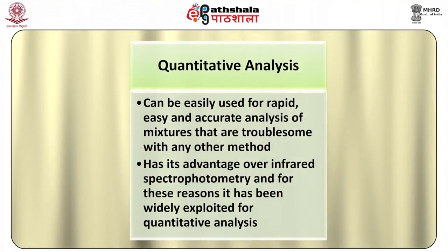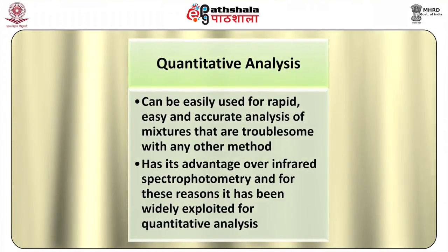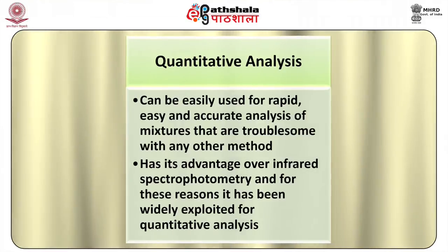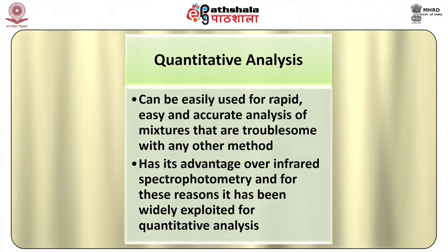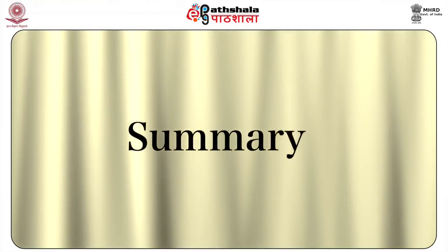Quantitative analysis. Raman spectroscopy can be easily used for rapid, easy and accurate analysis of mixtures that are troublesome with any other method. This technique has its advantage over infrared spectrophotometry, and for these reasons it has been widely exploited for quantitative analysis. Now let us summarize.